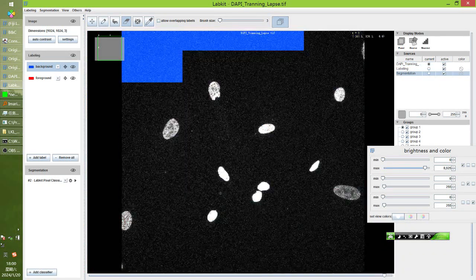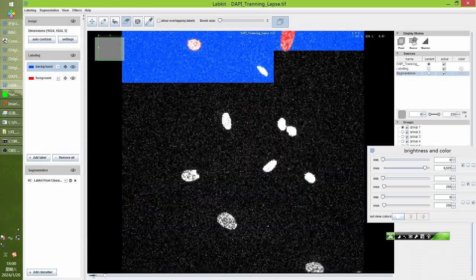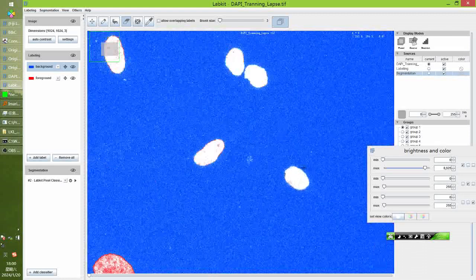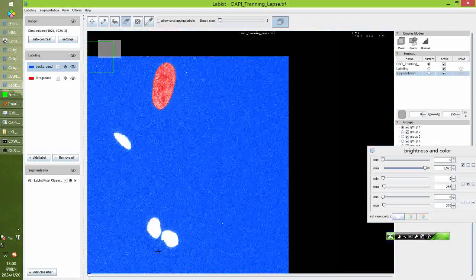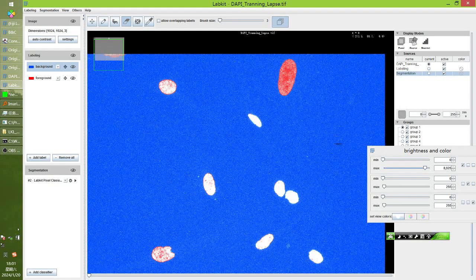Oh, it's already the second. So we go to the first 10 point. So we go to other 10 points and look at the results if it is okay or not. If it is not okay, we need to further modify and train again. So we do this again and again on the representative slices we selected until we are satisfied. And let's suppose that I'm satisfied now.